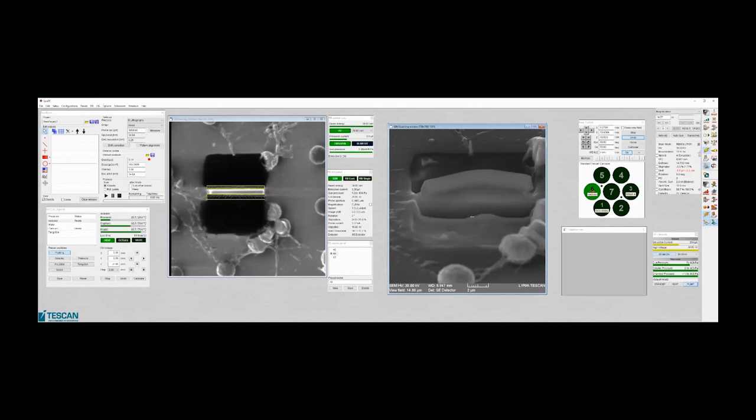So I don't know how we are with the time. I think fine. So we can continue in this process. Just for this one, I need bigger holes around. So I will move back to this bigger aperture.